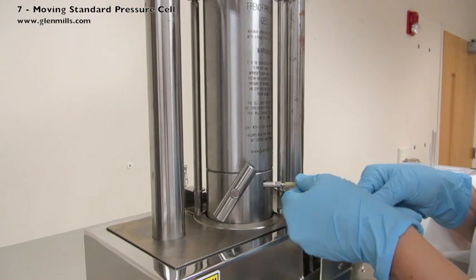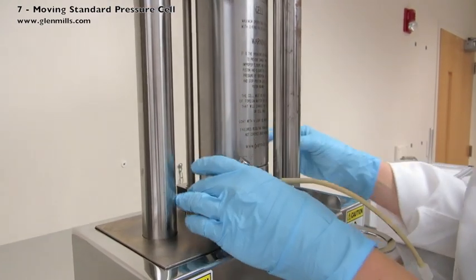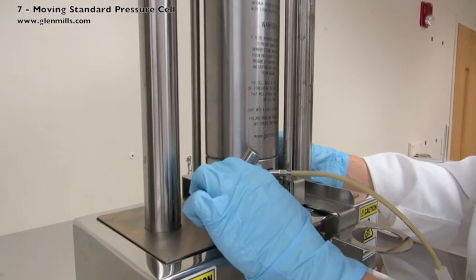A run of flexible tubing can be added to direct the flow. The flow valve assembly should be to the left side and is clear to turn.